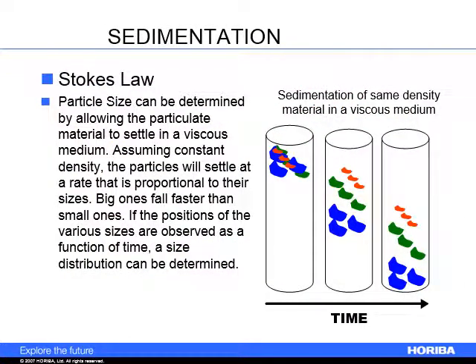Another method that is still used, in a very manual way, something you might do in a rudimentary type materials lab, is a Stokes law sedimentation. There are people in fields who sort different silt out of systems; they will actually allow gravity to sort things out by particle size on a prepared slurry. So you can use this as a simple way to measure particle size by how things settle.